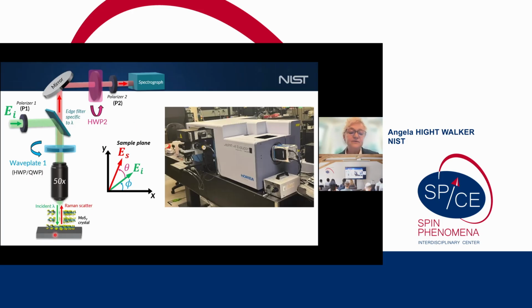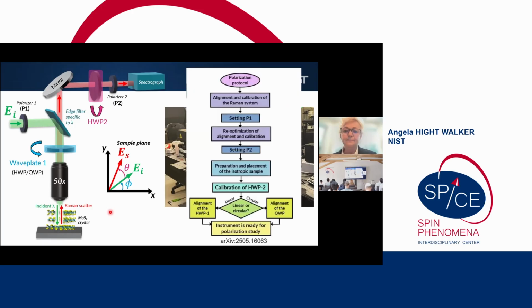Now, in this case, I'm showing an example of molybdenum disulfide because we're going to actually use that to calibrate the polarization data. I want to say what really led us to developing essentially a protocol. Again, this is a very metrology-focused issue: the polarization information and data in publications is really all over the map. And we saw so many errors and challenging data that was presented that I thought it would be good to do this.